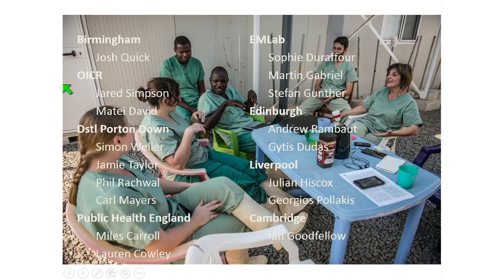The other thing to think about is what's actually in the motor at the time. So we need a model that actually understands what the motif is in the motor, because that's about 15 bases away from what's in the pore, and you need some kind of conditionality between what's in the motor and what's in the pore, and so that implies a slightly different model to the HMM that we've got. But I think it will happen.